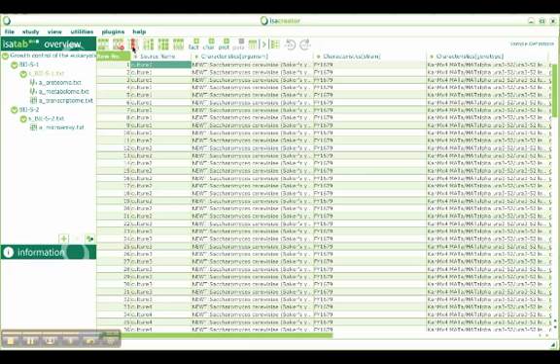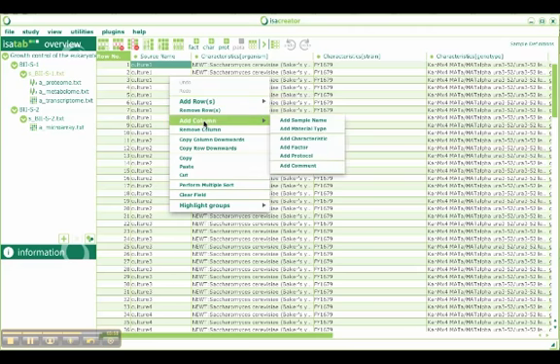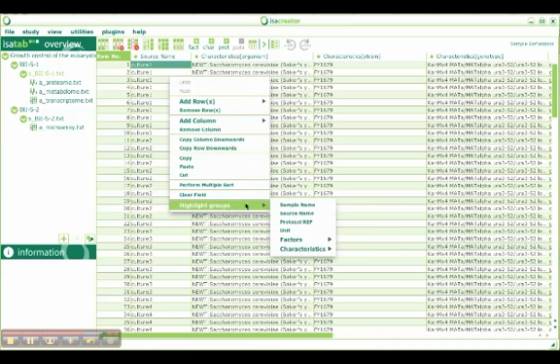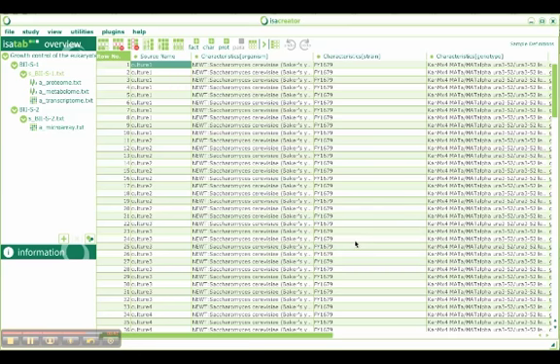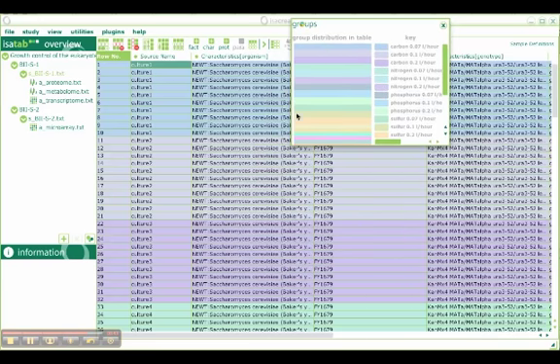You can include or remove columns as you wish. Also, we've got a contextual menu that allows you to add rows, to add columns, and to copy content. We also have some widgets to highlight groups. Typically we would like to see the study groups, and you can do that by selecting all factors, and you will have a color coding with a key to remind you what is the combination of factors and which record corresponds to the particular set.